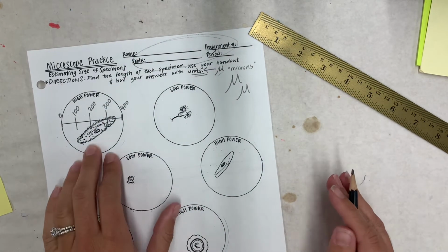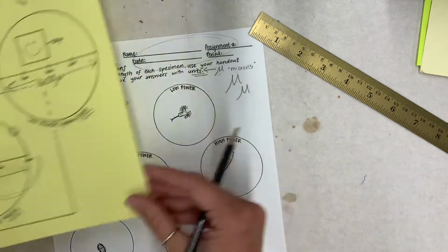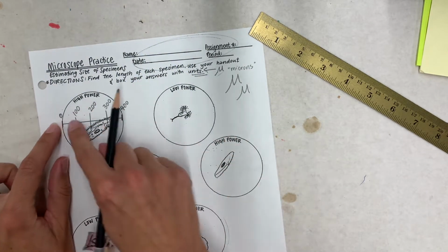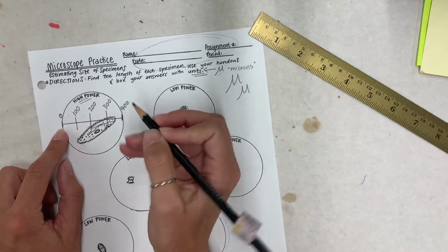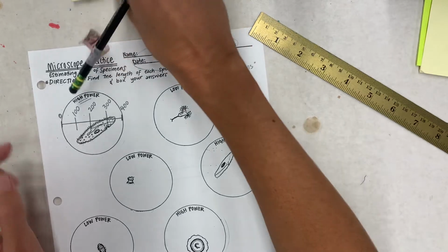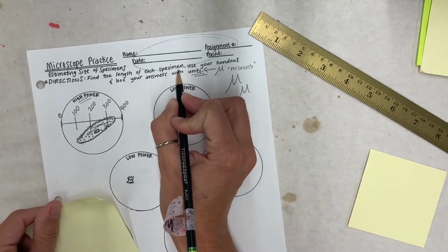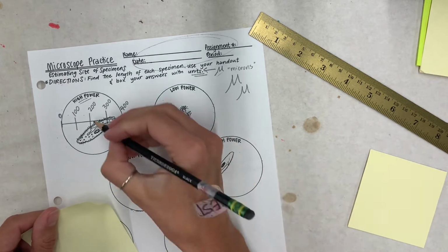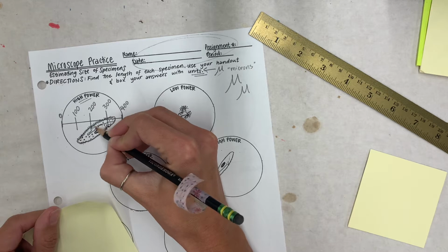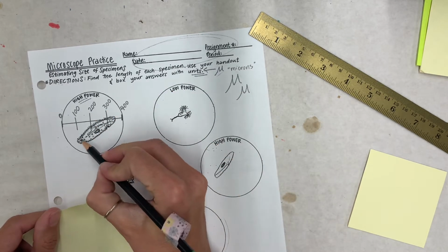So the first thing you need to do is draw the straight line with your ruler, use your handout, and put in the numbers of the known distance across the field of view based off of the magnification we're using. Now that we have that done, we are to find the length of a specimen, which is the longest straight line we can draw through a specimen. So we wouldn't, in this case, want to get the width of this guy. We want to get the length from end to end.